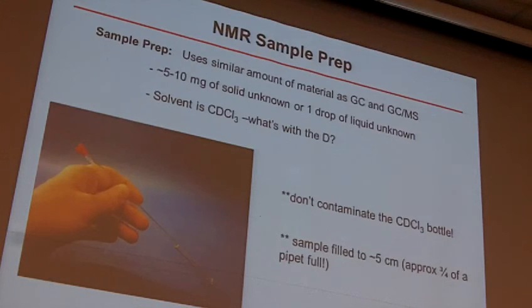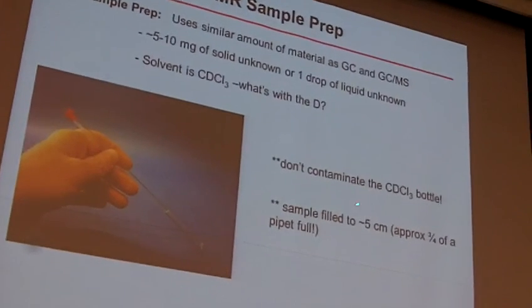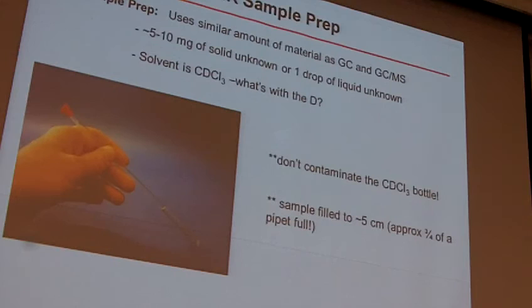Ultimately, again, you'll get more detail on this. You fill it to about 5 centimeters. My little tip of the day for you is that's about 3/4 of a pipette full. So when you pull the solvent up in the pipette, if you cram that bulb all the way down and pull it up, if that's a full pipette worth of solvent, you want about 3/4 of that is what will fill an NMR tube to the appropriate amount. Okay, about 5 centimeters, 2 inches is the right amount.